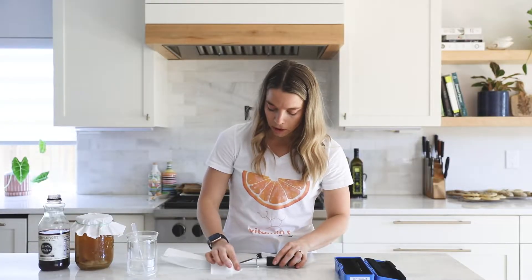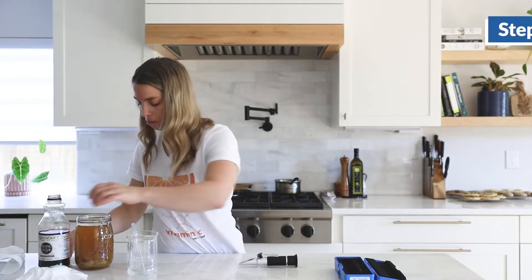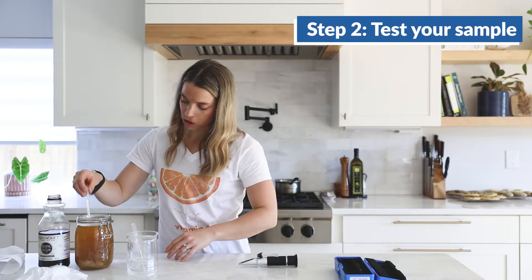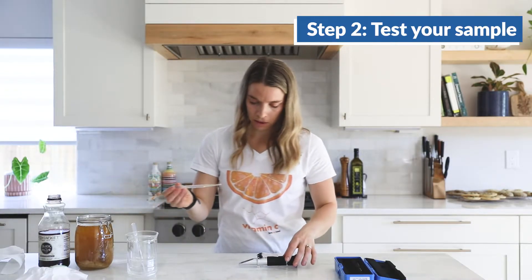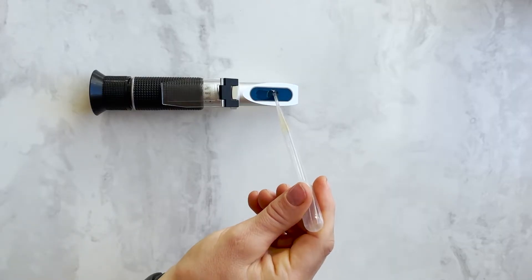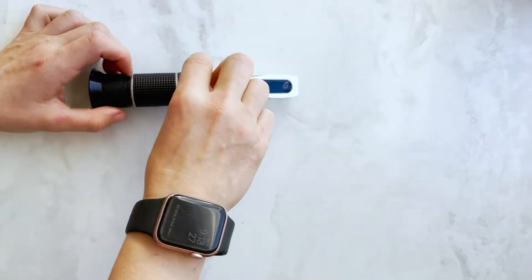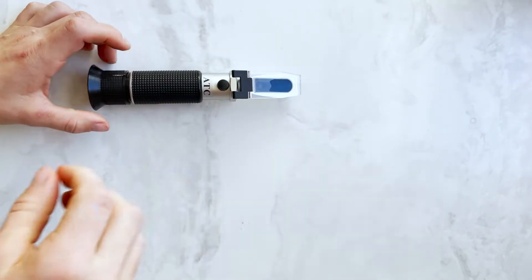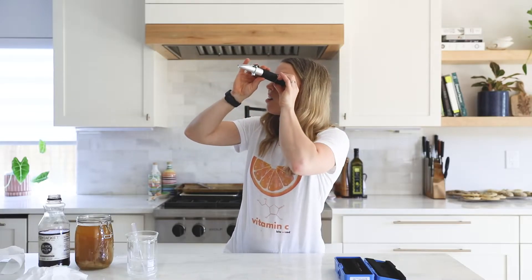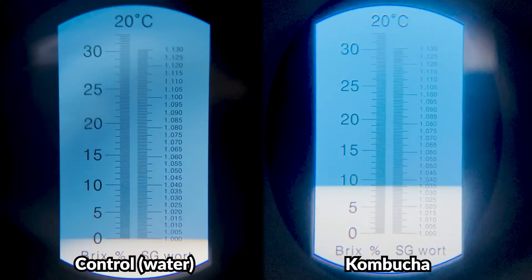Delicately wipe off the water and then take your liquid. I'm going to try the kombucha I have been brewing and see how much sugar content is in it. I'm just taking a dropper, putting about three drops on here, covering it, and then looking up to see how much sugar is in there.